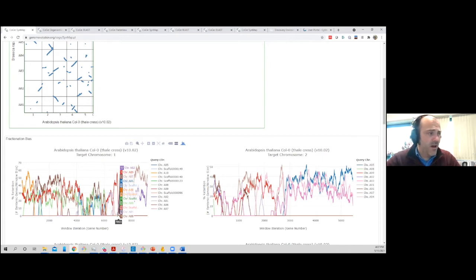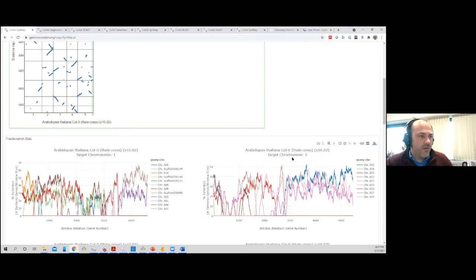And again, you'd have to look into this further, but this is probably a genome rearrangement event that happens specific to Arabidopsis. Because Brassica, for the most part, has retained a similar chromosomal structure to most other Brassicaceae. Arabidopsis is the weird one out. Here on the right arm of chromosome 2, you see these 3 subgenomes, these 3 chromosomes within Brassica kind of competing for conservation.